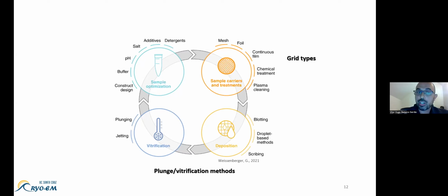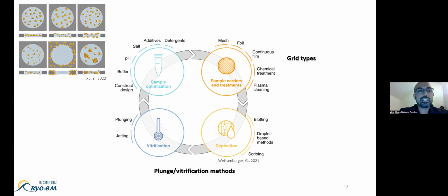And screening requires microscope time, which, as I mentioned, starts being very, very rare. So ideally, we want the sample distribution to be in the top left corner, but what happens in your initial screen is all the other options. So air-water interface, aggregations, they just like to stick on the carbon, they don't go in the hole, and the work and the hard lifting of a screening facility is actually optimizing those conditions in order to get the best of the best.